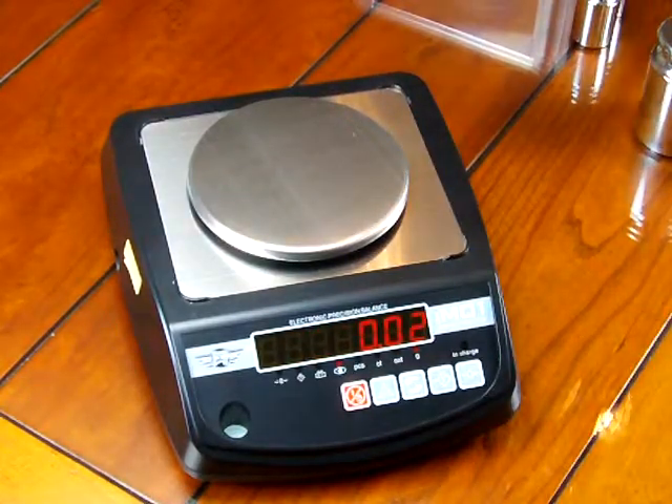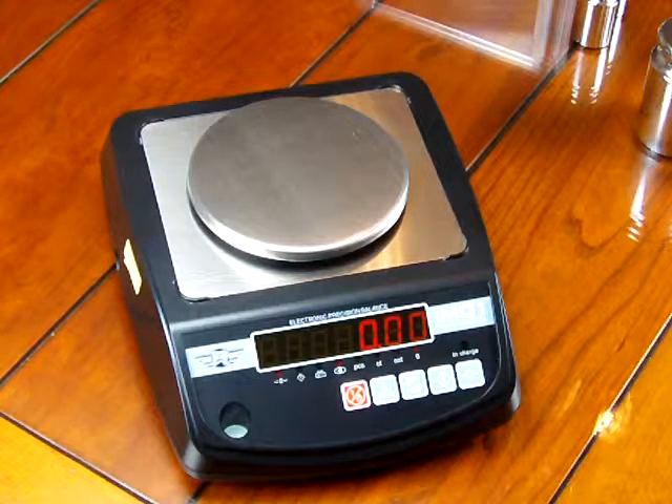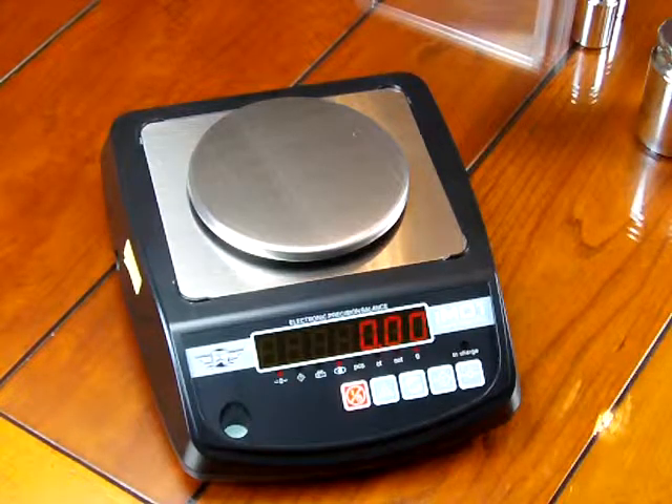So again, we just want to stress that when you purchase any scale, we highly recommend that you purchase calibration weights. This is the MyWay IM01. This is Precision Weigh and Balances. You can purchase this at either our website www.balances.com or www.scaleman.com.